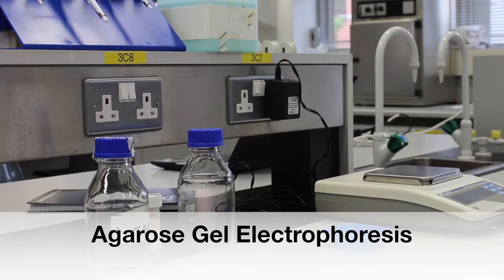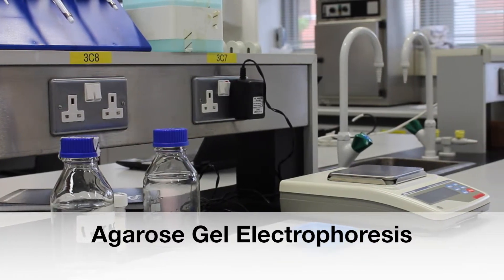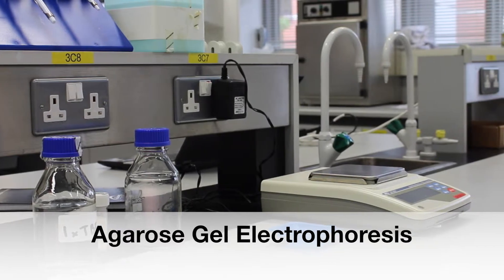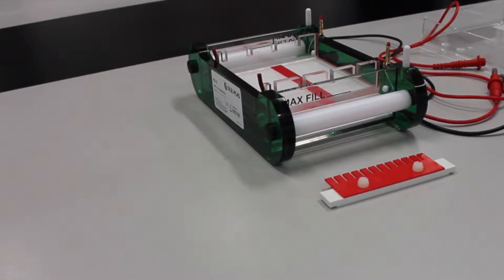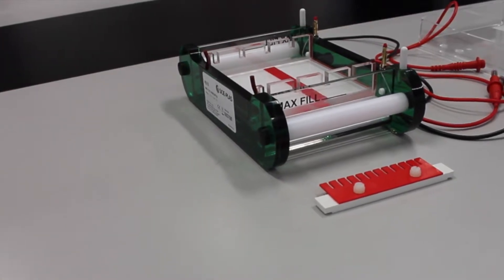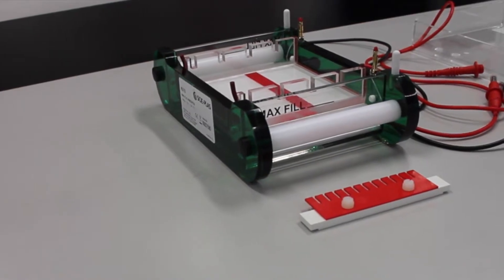This video is part of the iGEM Academy series, a beginner's guide. This tutorial explains how to prepare and carry out agarose gel electrophoresis. This popular technique is used to visualize and identify DNA fragments or proteins by separating them according to their size.